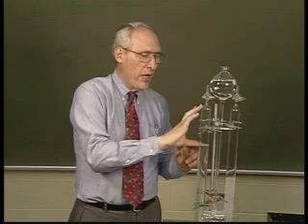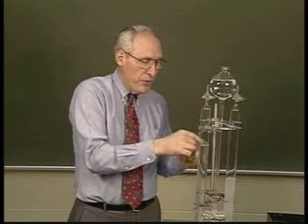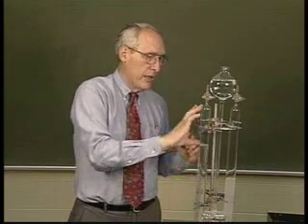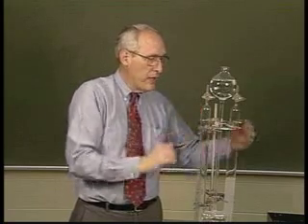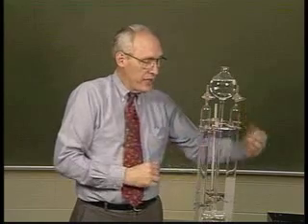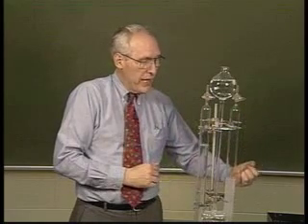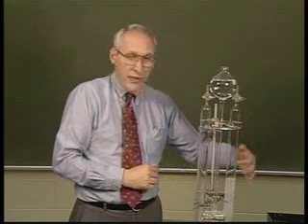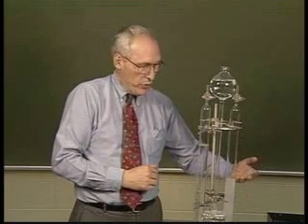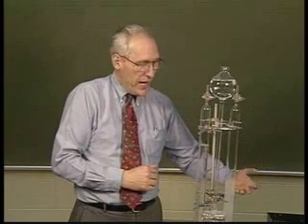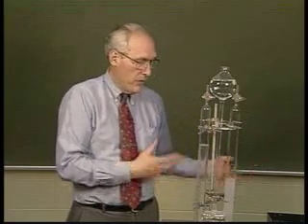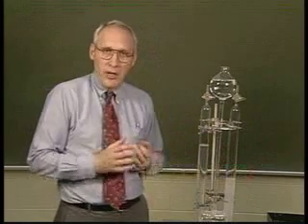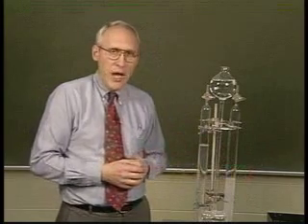On this side, you have a pocket of gas which pushes the fluid down and leaves the pocket. On this side, the gas has come up and created a pocket of gas here, pushing the fluid down. But when you see that, you'll notice that the pockets are not the same size — this one appears to be about half as big as the pocket on the other side.